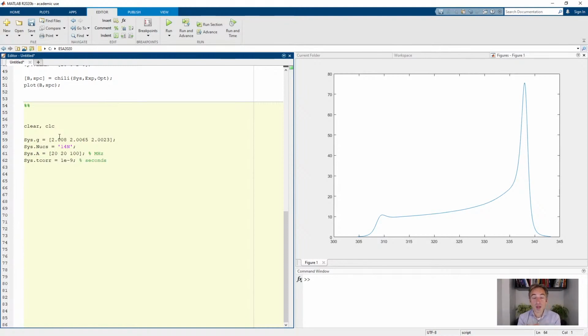So now in order to specify some motional restrictions or hindered orientations, you have to specify sys.potential. And it's named potential because it describes a sort of an energy landscape as a function of orientation. Certain orientations will have a low energy and other orientations of the nitroxide will have a high energy. And then those high energy orientations will be less accessible than the low energy orientations. I don't have too much time to go into the detail, but it uses a Wigner function expansion of an orientation potential here. And we can make a very simple one.